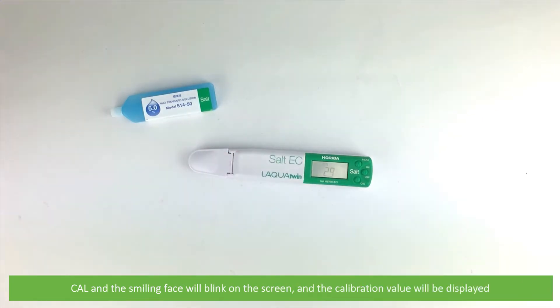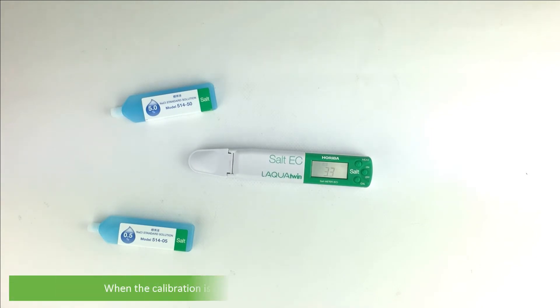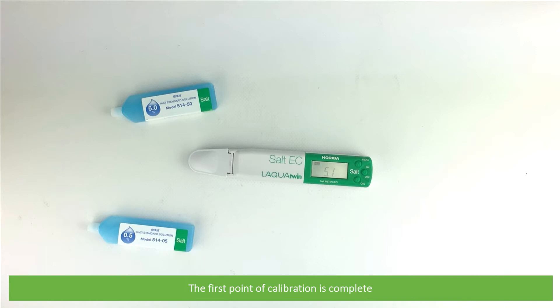Cal and the smiling face will blink on the screen, and the calibration value will be displayed. When the calibration is complete, Cal and the smiling face will stop blinking. The measured value at 25 degrees is displayed for one second, then the display automatically returns to measurement mode. The first point of calibration is complete.